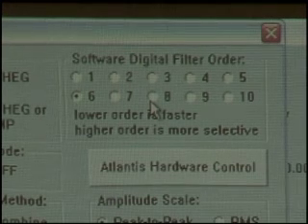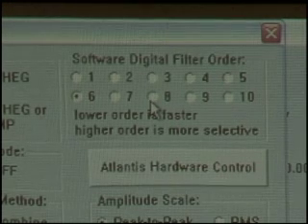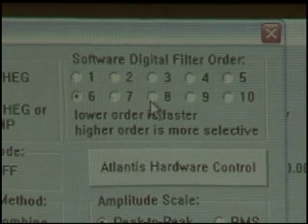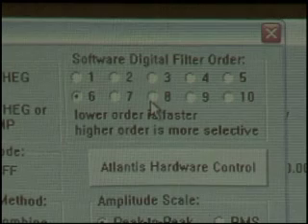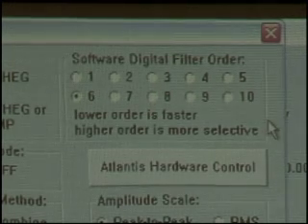Where are you right now? Data channels. Inside the box — software digital filter order. So the lower the digital filter order, the faster, the more forgiving the filter is. The higher order filter is going to be a little slower, but it's much more selective.